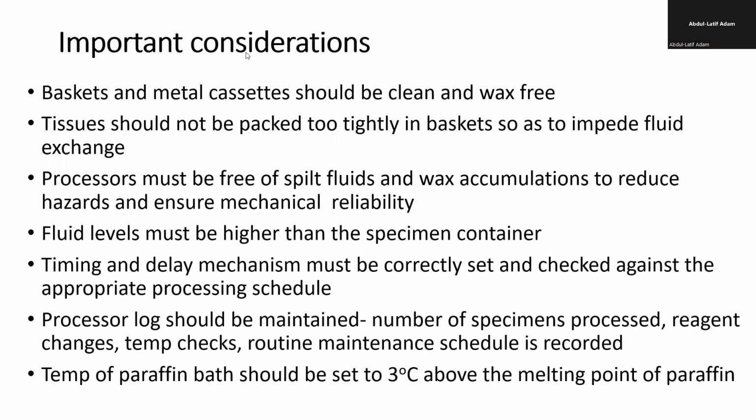Okay, and as I mentioned to you, the temperature for the molten paraffin should be set 3 to 5 degrees above the melting point of the paraffin.